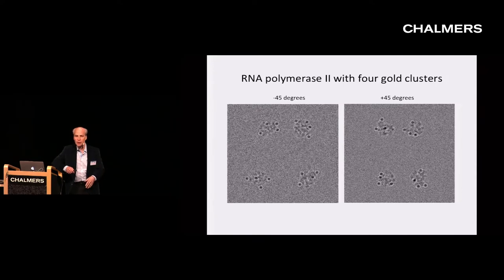It was a heterogeneous mixture. In fact, all of the particles that we could obtain from any source contained a wide range of particle sizes and were useless for our purpose. So we set about synthesizing clusters and spent the next 10 years learning how to do so.